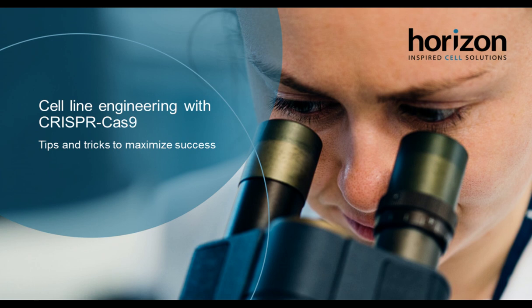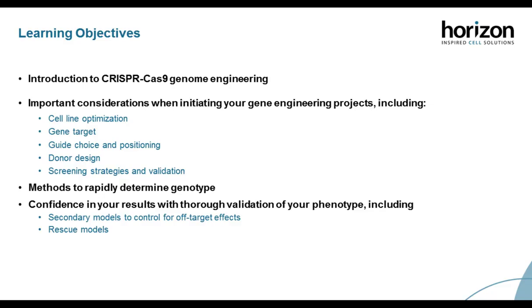So I'm just going to dive straight into the learning objectives of this webinar and what I aim to cover. We are going to run through important considerations to make when initiating your gene engineering projects. And these will include the cell line optimization, considerations to take about your gene target, guide choice, position, and donor design. And finally, we're going to talk through different screening strategies and validation techniques that will help you find the important resultant clones.